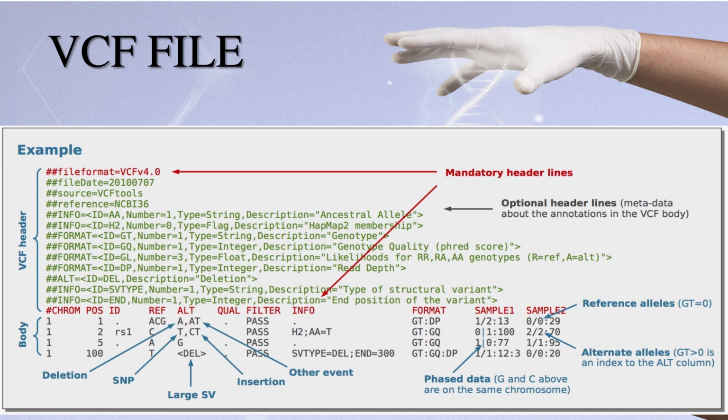Now, delving into the subsequent section, which commences with a header line, it's imperative to note that the first 8 columns in the ensuing section are obligatory. These columns, tab-delimited, encapsulate properties observed at the variant level. In instances where a VCF file accommodates multiple samples, certain site-level information will be an average or summary of values obtained for that site from various samples.